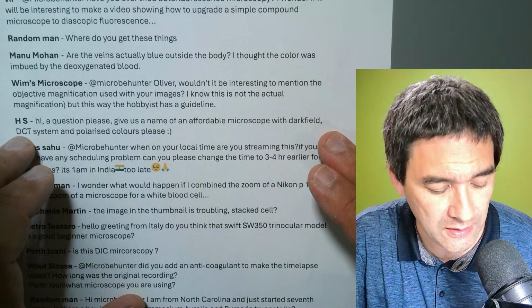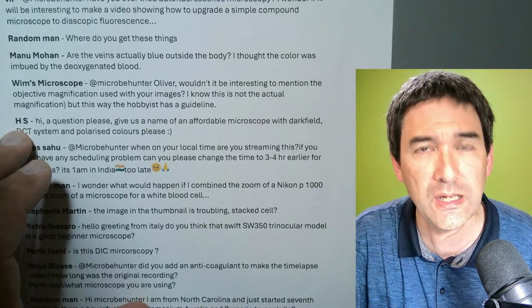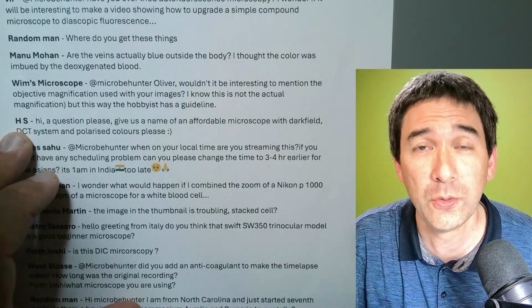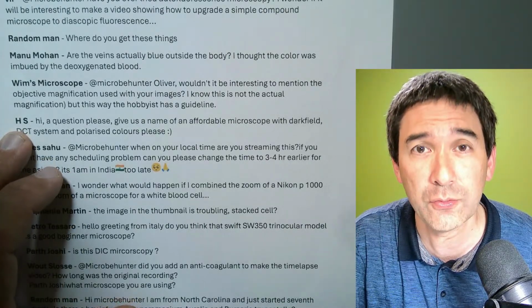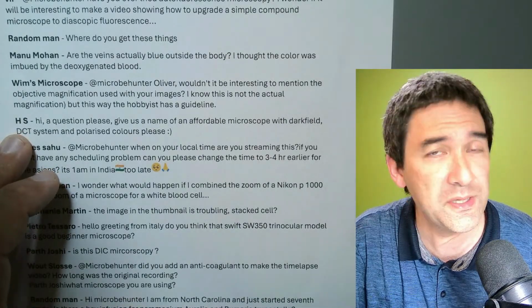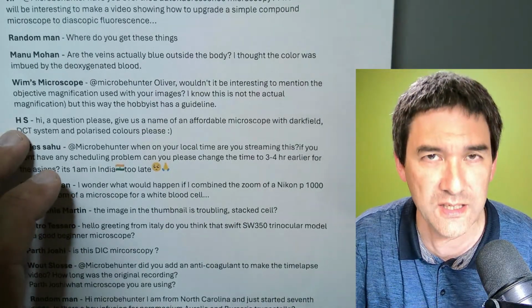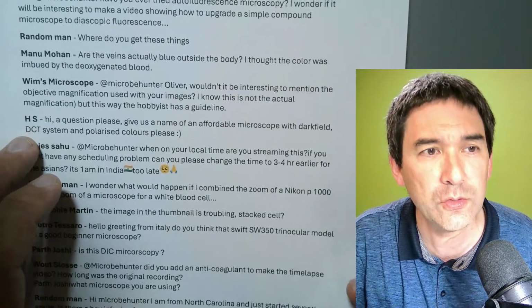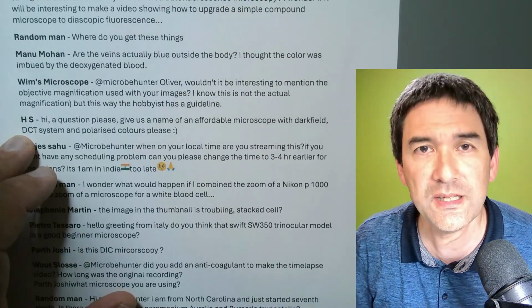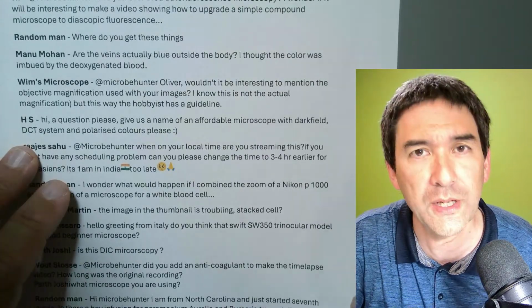But DIC, which I suppose that you mean, which is the one that I have, is essentially you need to talk to high-end companies. I know that the company Euromex has a microscope that basically has DIC. Olympus, of course, Nikon, Zeiss, they all have it, but that's getting expensive. So what I recommend generally for hobbyists, if you want to get similar images like in DIC, is to use so-called oblique illumination and color filters, and you'll be surprised at what you're able to get.